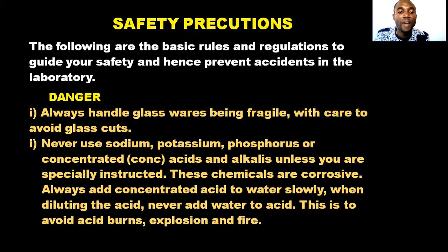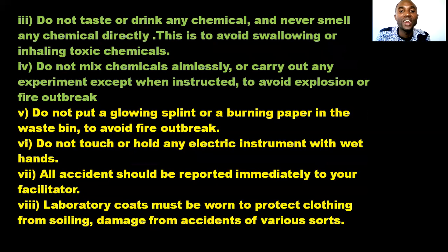Never use sodium, potassium, phosphorus, or concentrated acid or alkalis unless you are specifically told to do so by your instructor, by your teacher. These chemicals are corrosive, they are dangerous. If you are not instructed how to use them, don't tamper with them, because touching water or your body can be a problem. So always do this when you are instructed, to avoid acid burn, explosion, or fire.